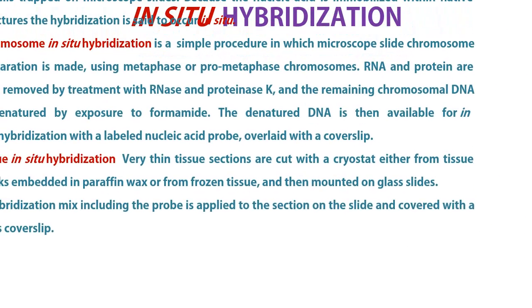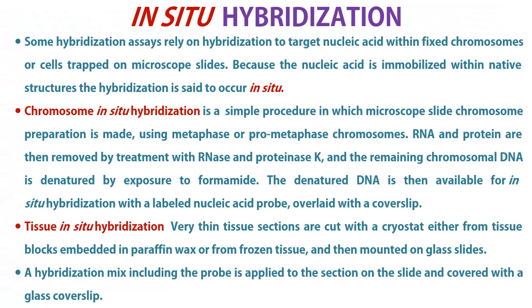In situ hybridization. Some hybridization assays rely on hybridization to target nucleic acid within fixed chromosomes or cells trapped on microscope slides. Because the nucleic acid is immobilized within native structures, the hybridization is said to occur in situ.